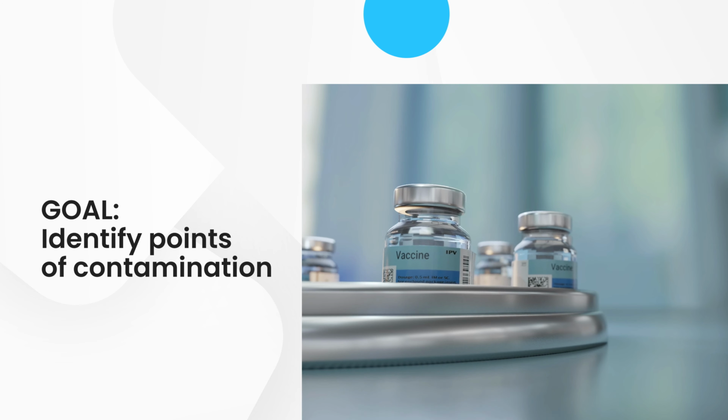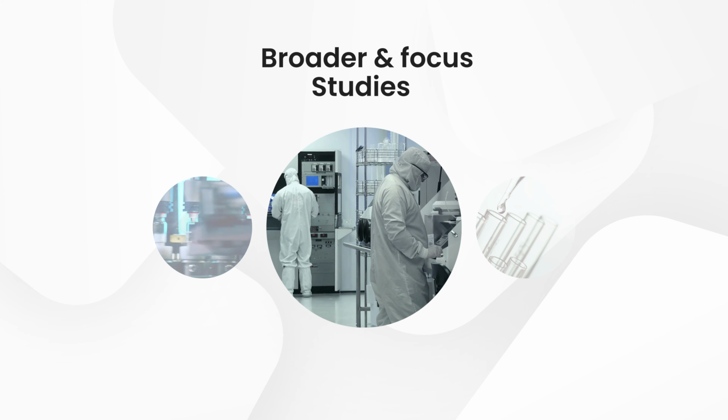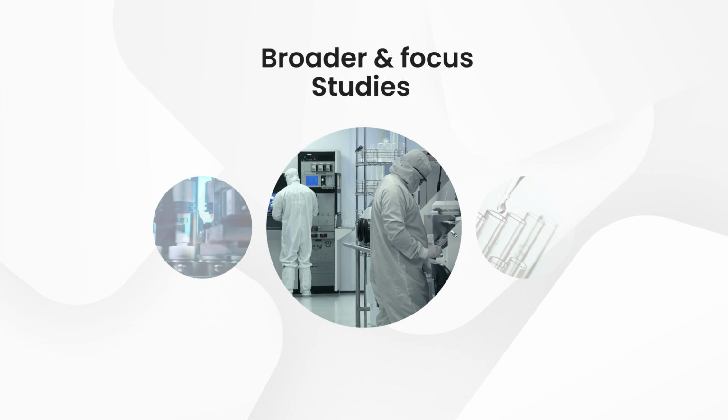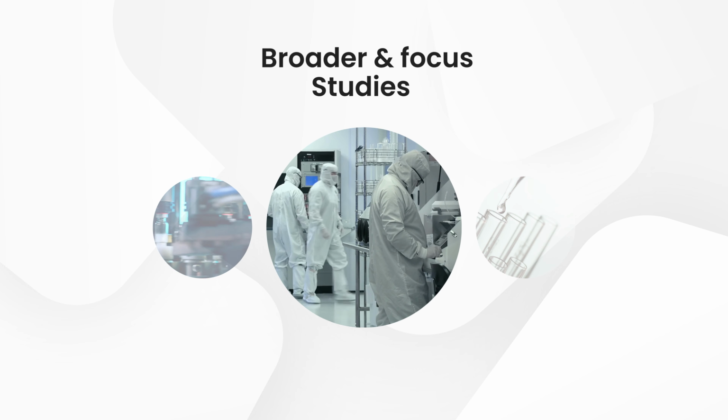of contamination. Other types of aseptic process studies include broader process simulations that might incorporate various aspects of the manufacturing flow, as well as focused studies on environmental monitoring and personnel monitoring to assess the effectiveness of contamination control measures.